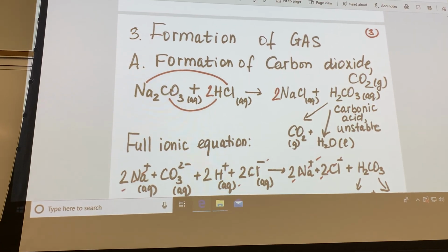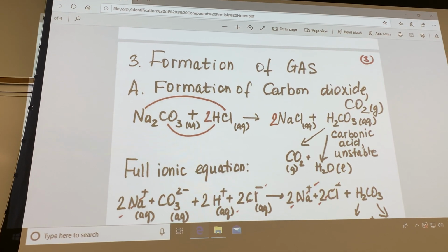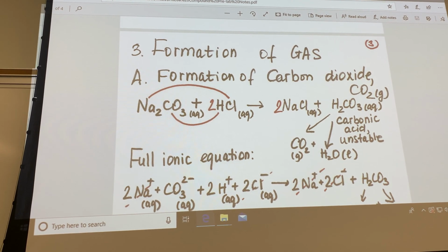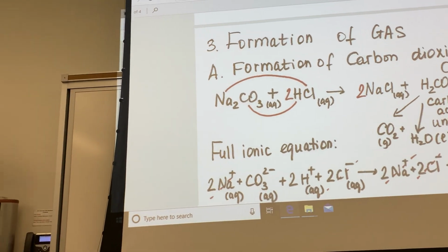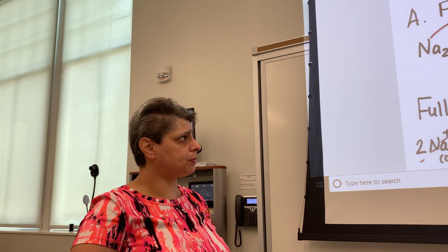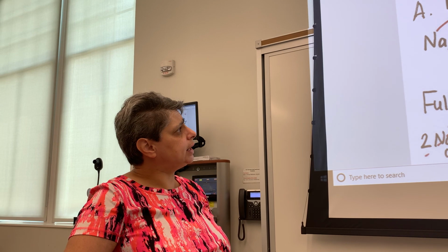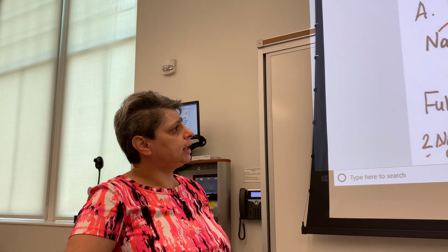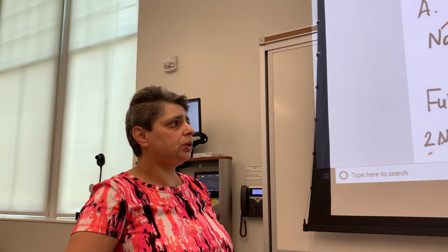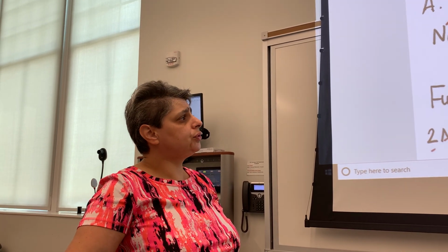Next, we're going to consider two important reactions, both important for this particular experiment, which involve formation of gases. And with gases, the difficult part always is to make sure you can detect formation of gas. With precipitate, it's obvious because your mixture becomes cloudy. But with gases, it's a little trickier. So how do we figure out when gas is produced? I'm going to show you both reactions from this experiment. Those are the only two where gases are produced.